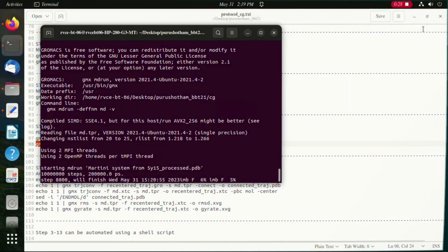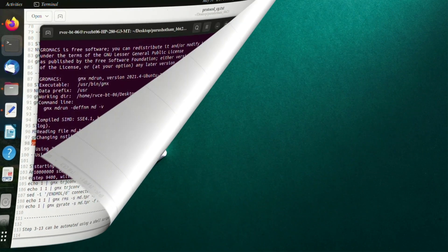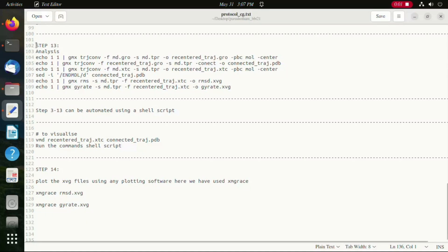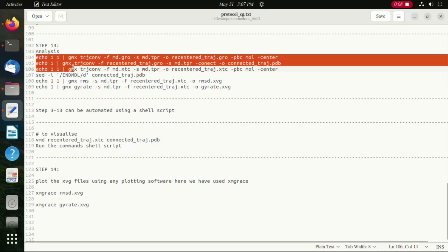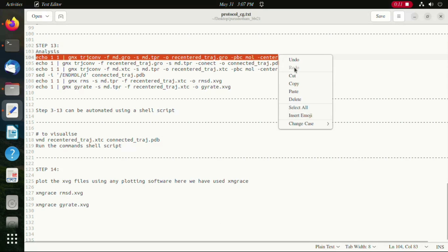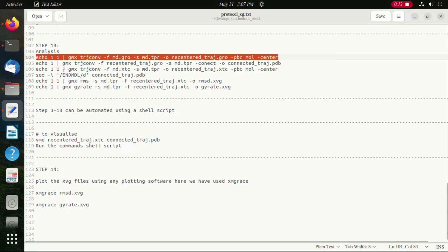Once the production run is successfully completed, we move on to the analysis steps. To visualize the trajectory or the PDB we need to connect the atoms to show the bonds and also remove the boundary conditions. The first four lines of commands are used for that. The last two commands are used to calculate the RMSD and the radius of gyration respectively.